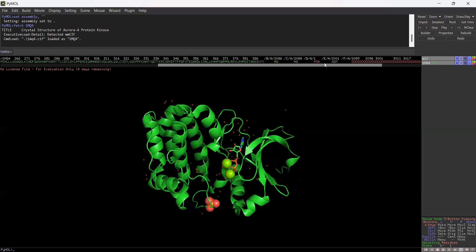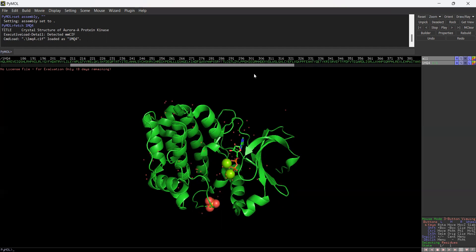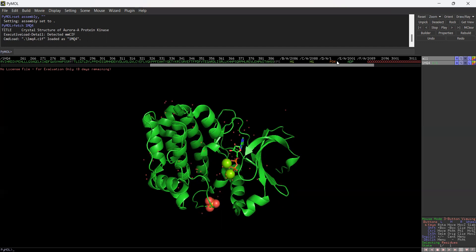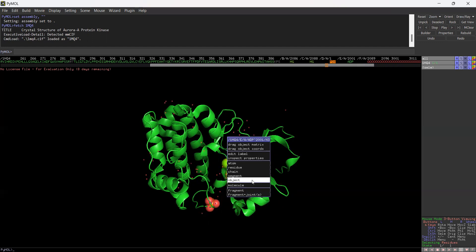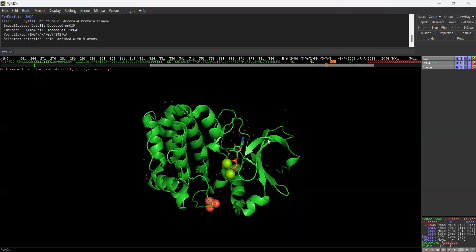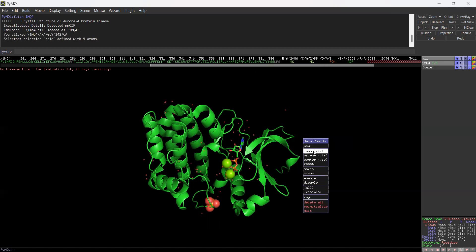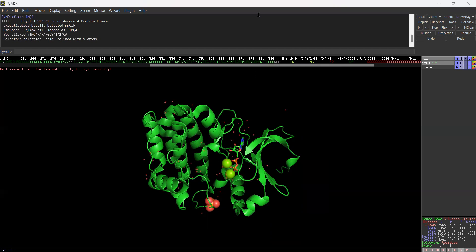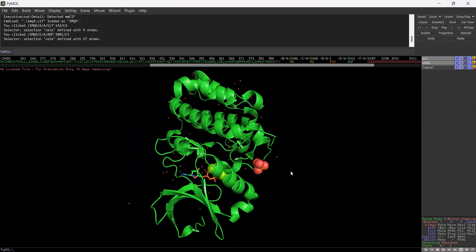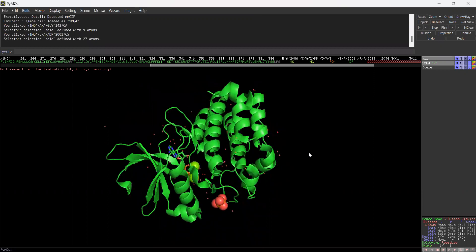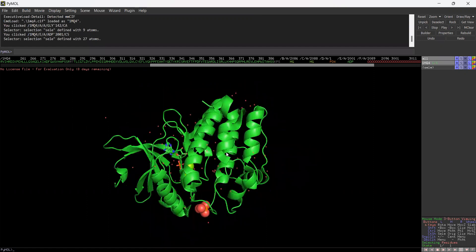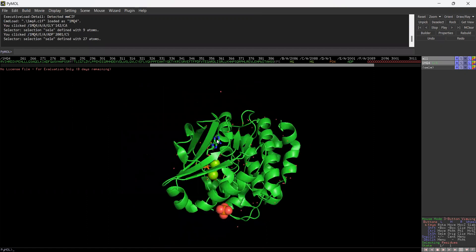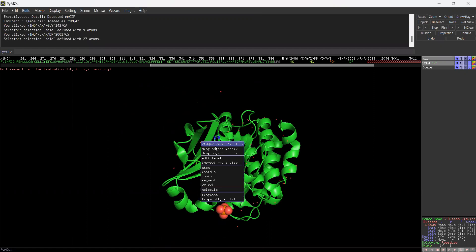Two magnesiums are present, and one phosphate group is available with ADP. If you want to select any particular phosphate group or the ligand group, you can either go by selecting from the sequence panel or else you can just double-click. So if you want to select a particular ligand, you can go by selecting the particular residue from here. You can zoom and have a look at the particular visualizations.